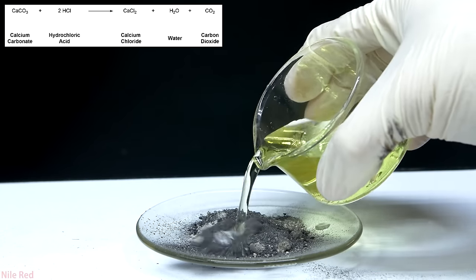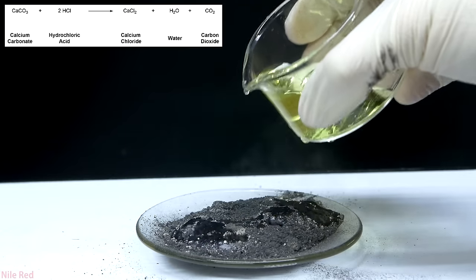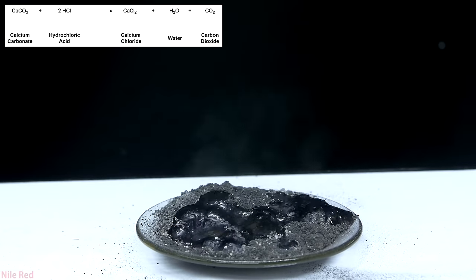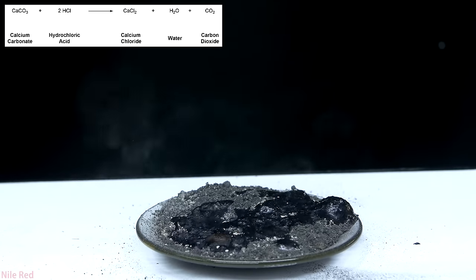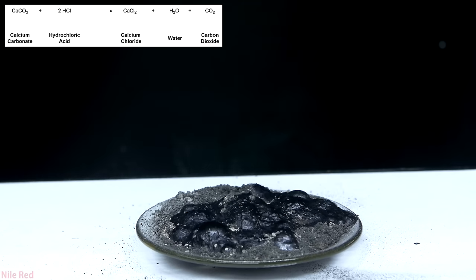What we're doing here is verifying the presence of calcium carbonate by reacting it with a little bit of hydrochloric acid. When calcium carbonate and hydrochloric acid react, they produce calcium chloride, which is a salt, but they also produce CO2 gas. Once the hydrochloric acid is added, you can see that a lot of gas is produced, and this is a strong indication that calcium carbonate is present.